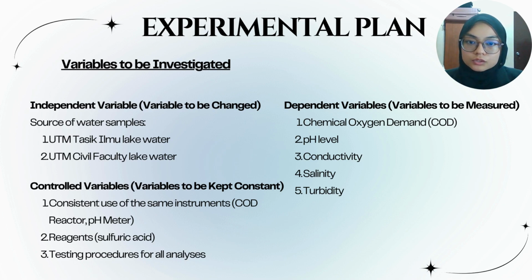So for the experimental plan, as we know in this experiment, we don't have a formula to use to calculate the data, because all the data will be valued by the machines. Okay, I will proceed with the variables to investigate.